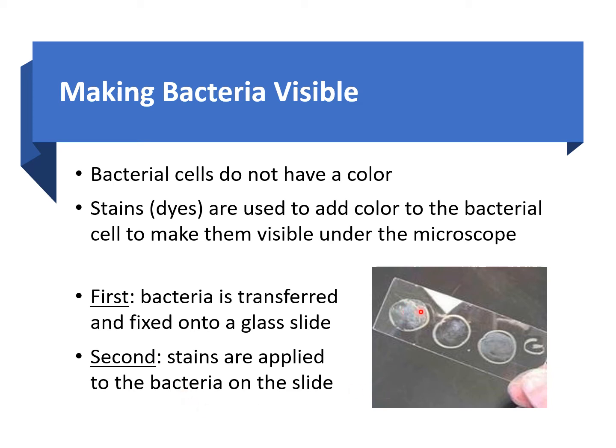And when you prepare your smear, by the way, you don't want your smear to be, as I said, too thick. Meaning that when you take a look at it, if your smear is super white, that would tell you that you've actually transferred a whole lot of bacteria. So compare this smear right here to this one right there in the middle. Notice how the one in the middle is not very white, and that's actually better.